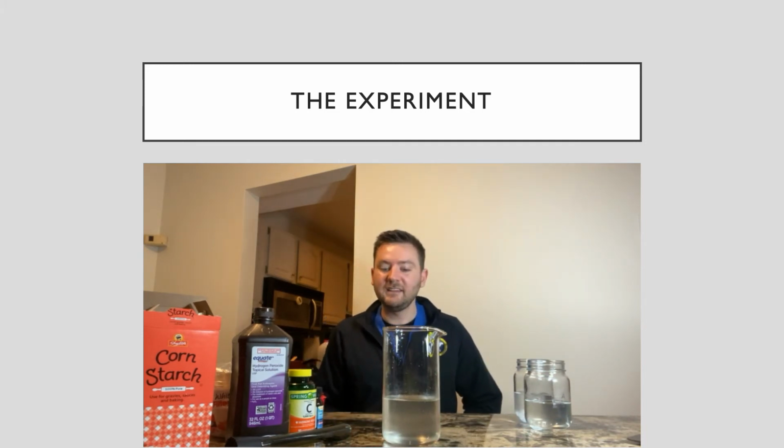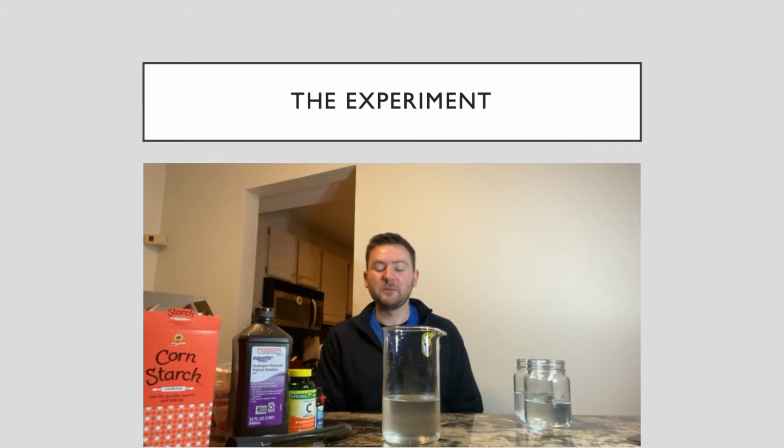Now we'll give this a little bit of time and we hopefully will see a color change. It can take a little while, so bear with me here, but there's a couple reactions going on right now that will be explained in the next couple slides. And we shall see hopefully the water change colors here. Again, it may take a little bit of time, so we'll be patient, and I'll probably speed up this video because you don't want to see me just sitting here waiting. So in the meantime, we'll just keep an eye out and see what happens.